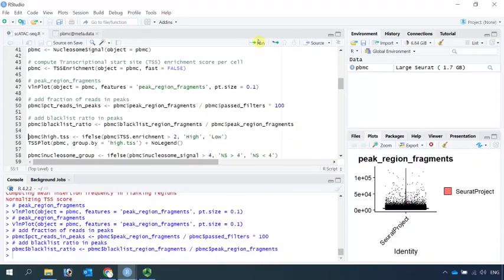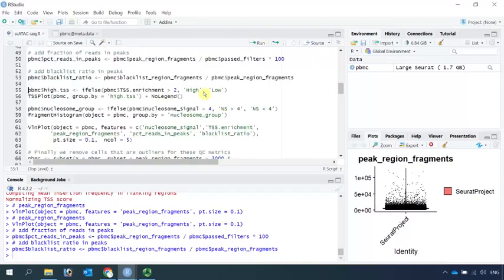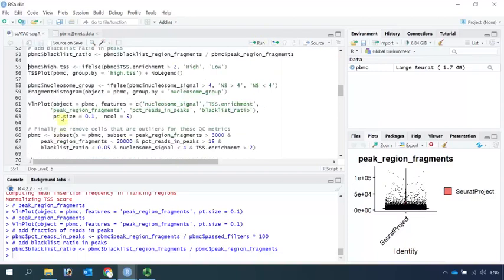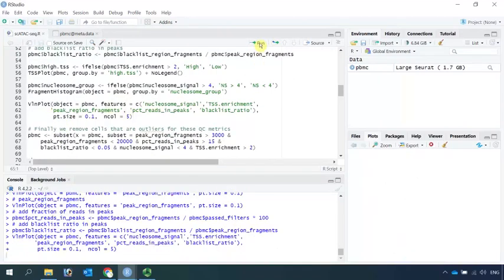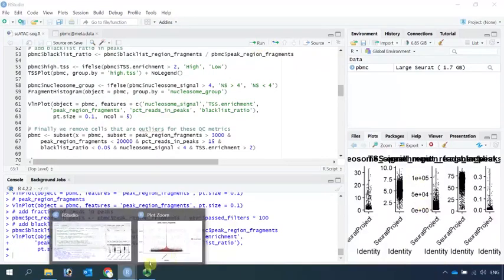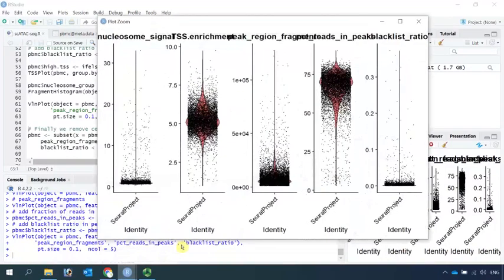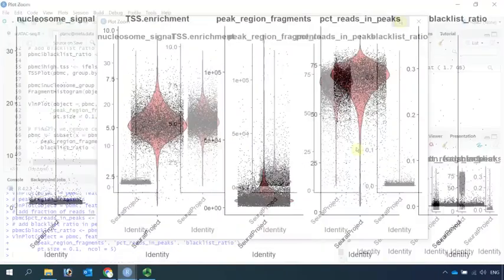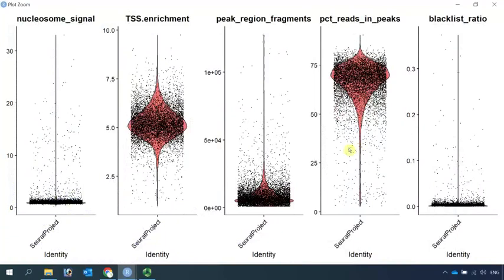We can add the blacklist ratio in peaks into the metadata. Now we have all the metrics data to perform quality control analysis. We can use the violin plot function to have a look at all the metrics data. Let's zoom in. You can see from the violin plot, for the nucleosome signal, cells in this region are high-quality cells.